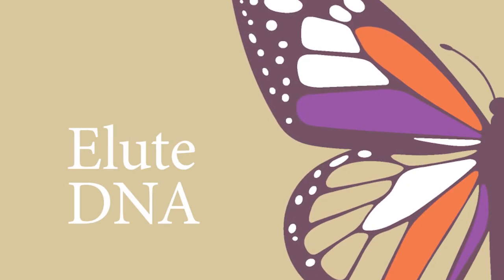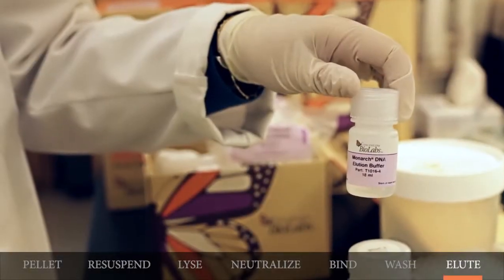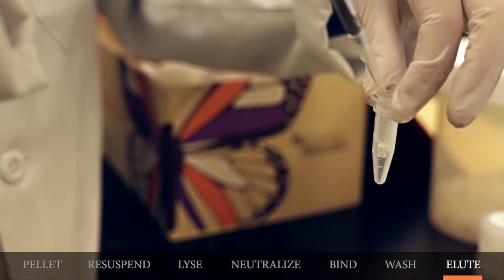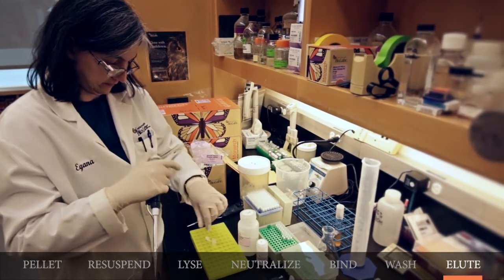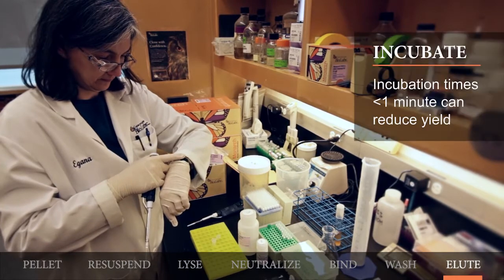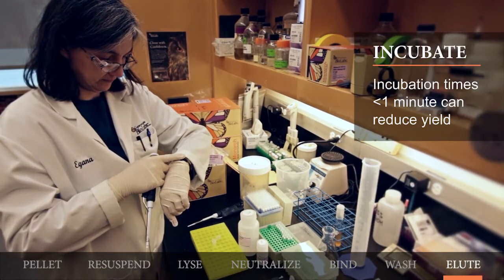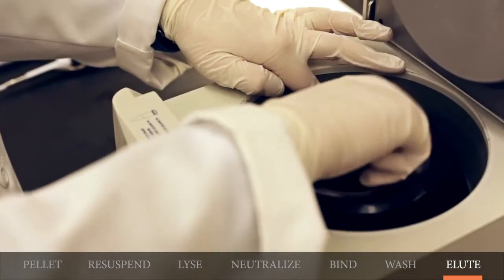Now for the elution step. You will add a minimum of 30 microliters of DNA elution buffer to the center of the column matrix. Incubate the solution for one minute at room temperature. This incubation step is very important to guarantee maximum yields. Centrifuge for one minute and collect the flow-through. The flow-through now contains your purified plasmid DNA.